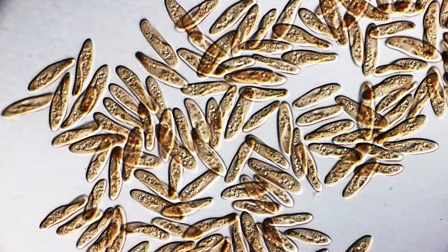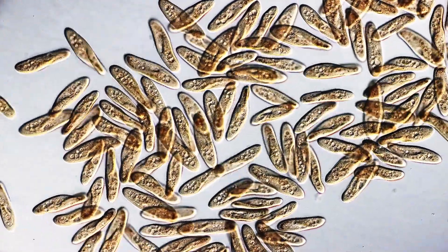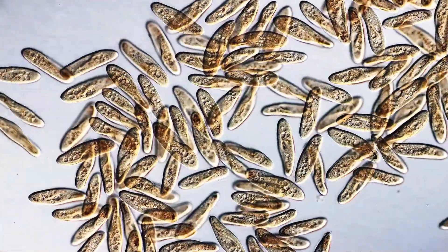Hi, hello and welcome again. MicrobeHunter here and today in this video I would like to explain to you two methods that allow you to slow down microorganisms to the extent that you can watch them and observe them more easily under the microscope.